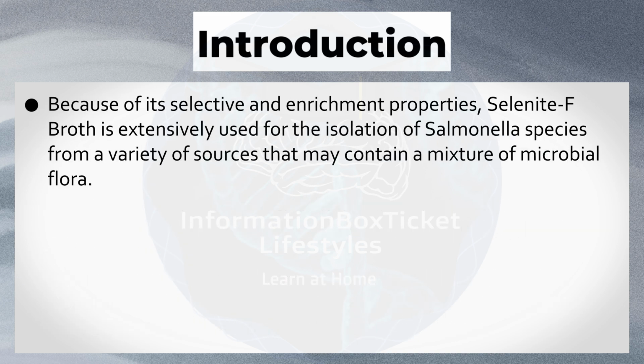Because of its selective and enrichment properties, Selenite F broth is extensively used for the isolation of Salmonella species from a variety of sources that may contain a mixture of microbial flora.